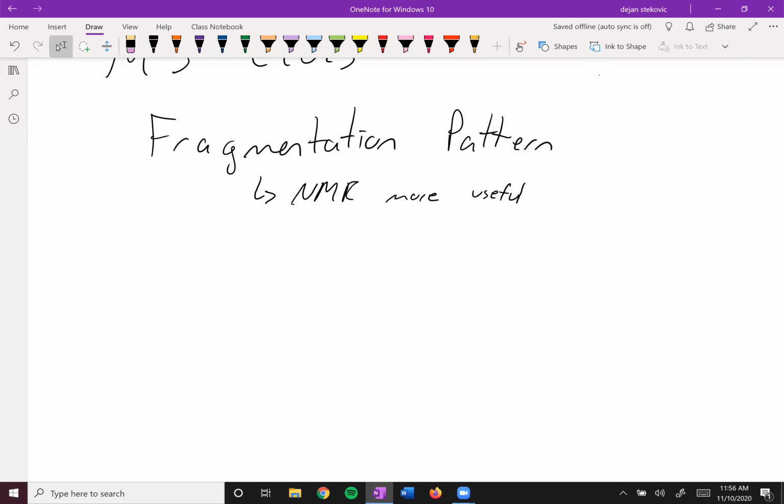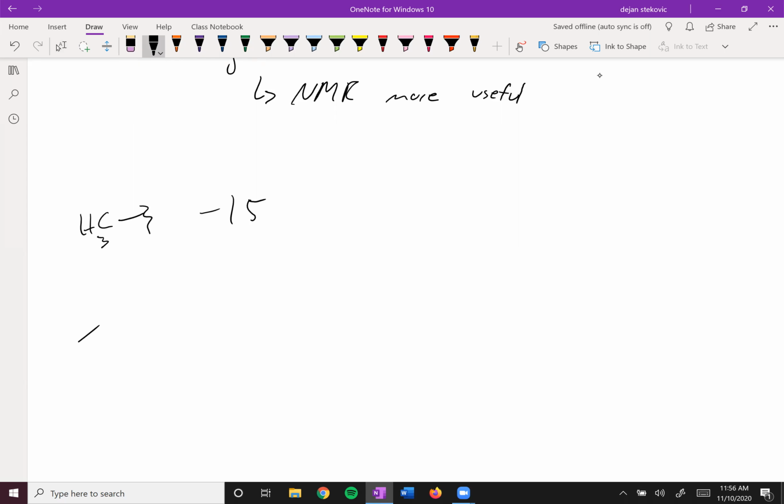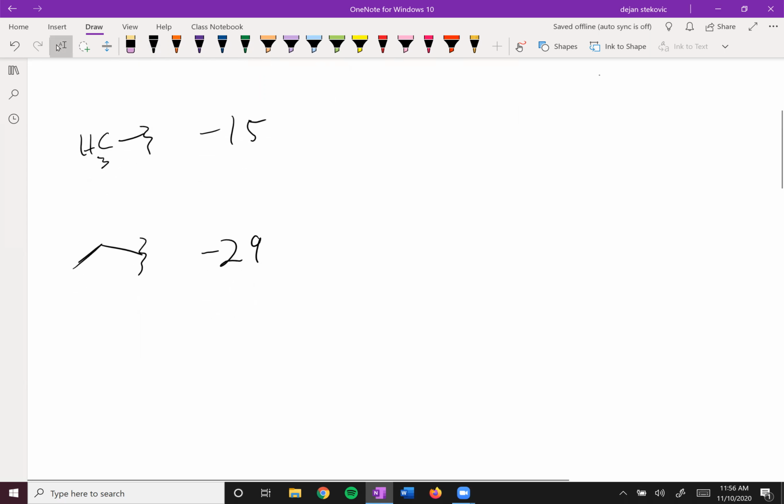But basically, what you can think about is fragments of carbon chains breaking apart. So for example, if you had a methyl that would break off, you'd see a peak at minus 15 AMU or grams per mole from your molecular ion peak. If you had an ethyl, it'd be minus 29, right? That's the mass of an ethyl. Or if you had something maybe like a propyl, you just add another 14 to it. So let's see, that would be 43, right?